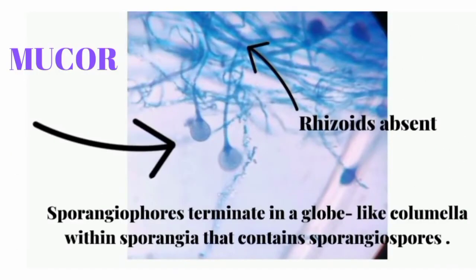Next one is Mucor species. Both Mucor and Rhizopus have aseptate hyphae, meaning septations are not present. Above is a globe-like structure which is the sporangium, and within the sporangium, sporangiospores are present. One more difference is that in Mucor, the nodal rhizoids which are present in Rhizopus are absent.